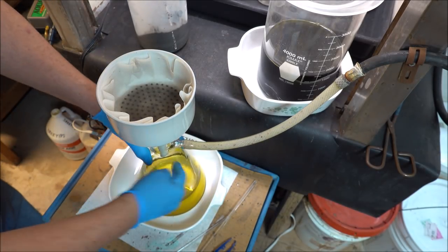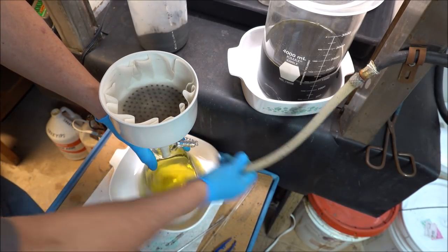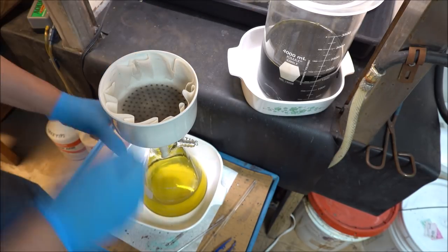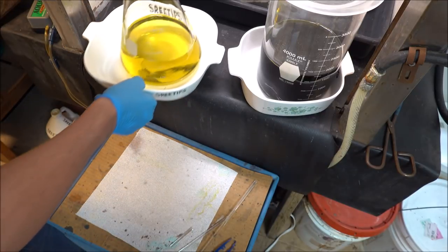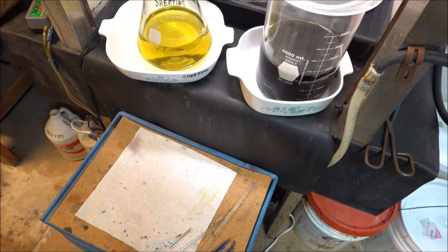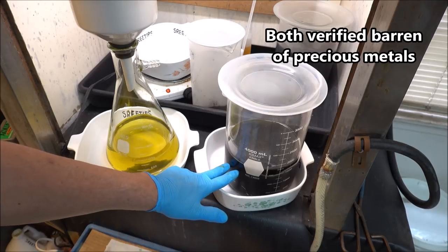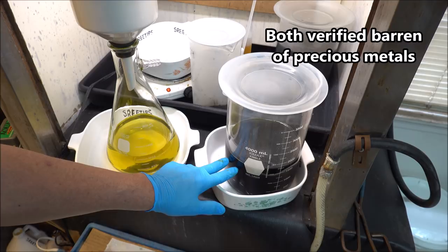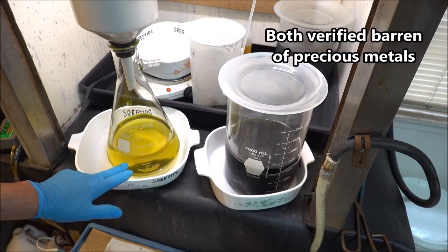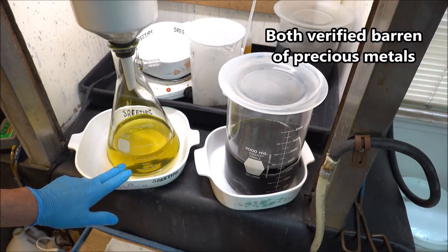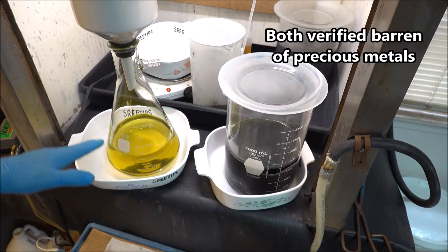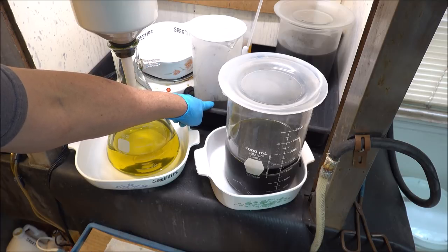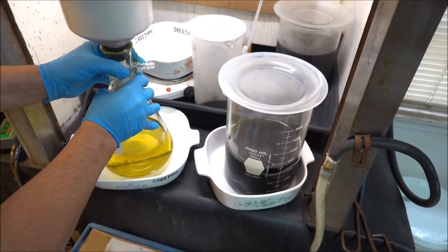I've got our fifth hydrochloric acid boil filtered off now. I want to set this up here so you can see the difference between the two solutions. This is the first four hydrochloric acid boils. Notice how dark the solution is. This is the fifth one. At least I can see through it. So now it should be clean enough to hit our ground up material with some aqua regia.